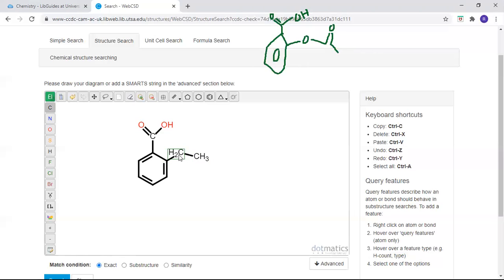So here, this should be an oxygen where it says CH2. So we're just simply going to click on oxygen. See how the green square comes up? We click on it, it replaces it with an oxygen. So notice that this CH2, we need a double bond again. So I want to select double bonds, click and drag. So again, when you get the green square, that means you're good to drag.